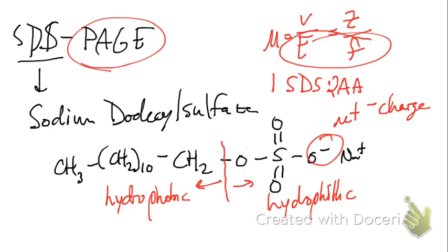So let's look at acrylamide. Let's do it in a different color. I know this slide is pretty busy and I apologize, but we'll just put it all on the same one. Here's acrylamide. Free acrylamide, unpolymerized, is very toxic. It reliably causes cancer. It's a neurotoxin. It's a very powdery substance. So usually we have to be very careful around it.